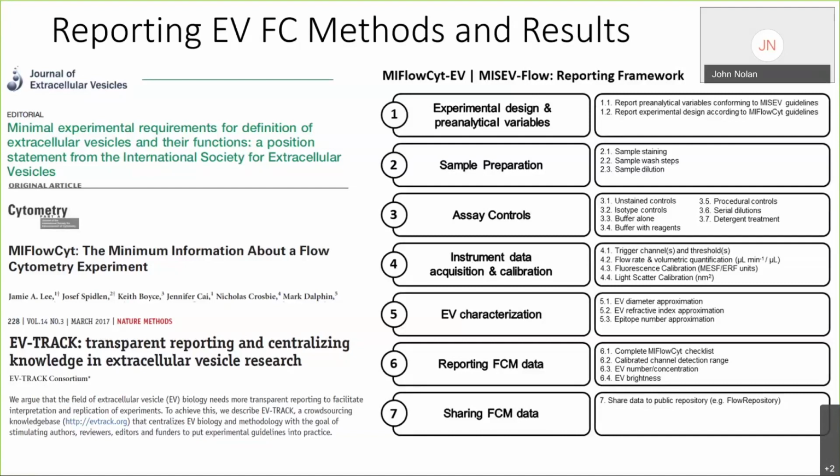And so if you read the manuscript, which I recommend everyone does, you'll find we broke the process down logically from sample preparation to data reporting and sharing into these different categories.